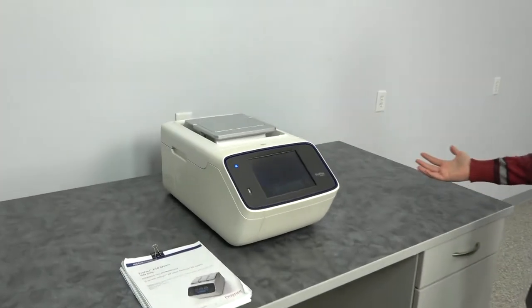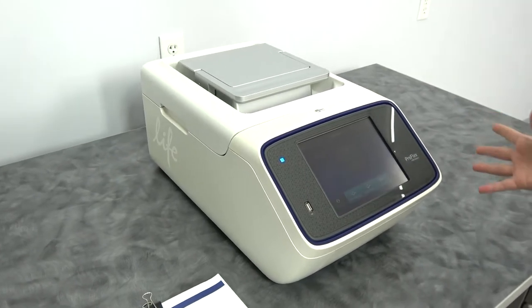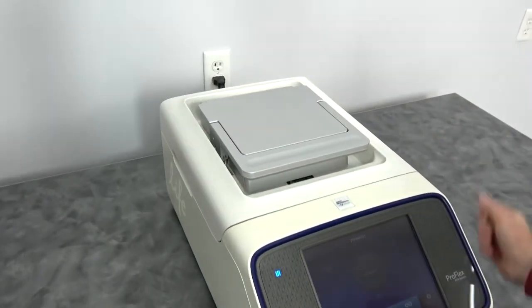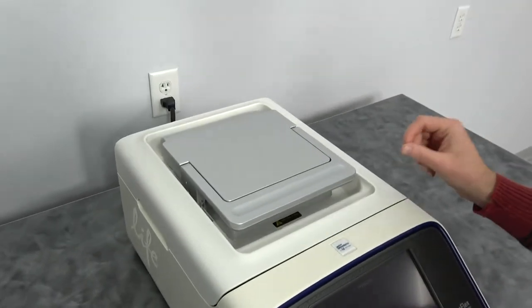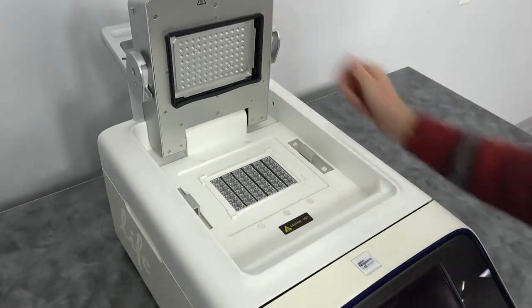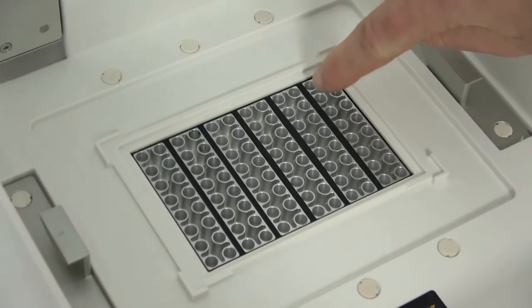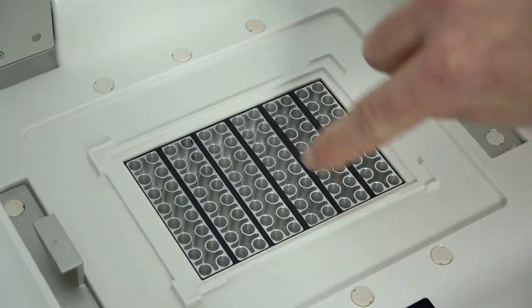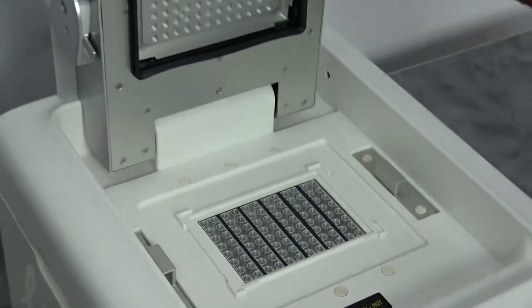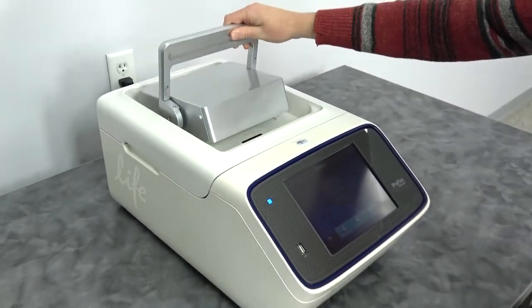You all know what a thermal cycler is, but one of the champion features of the ProFlex is that it has interchangeable blocks, and maybe some that you're not used to. There's a 3x32 well block. This one's installed with a classic 96 well block, but you'll notice it has some little rubber separators, which allow you to run individual runs for each one of those six sections on this block.